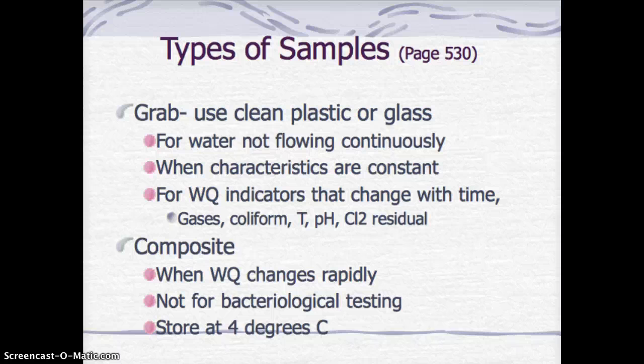And now composite samples are usually for a situation where water is flowing pretty rapidly, so its quality is changing rapidly. It is not used for bacteriological testing, and typically the samples need to be controlled and kept at 4 degrees C.